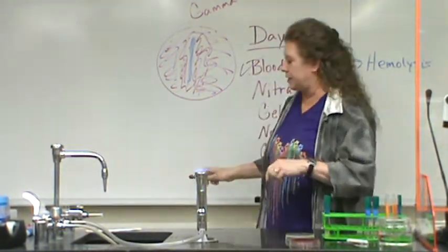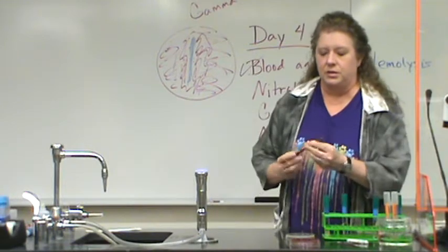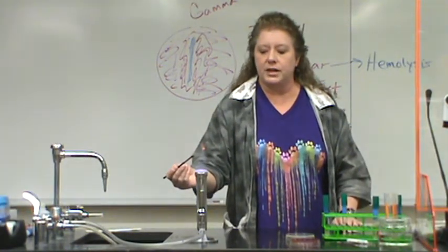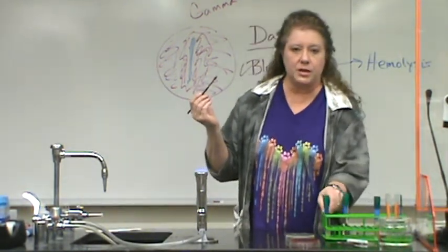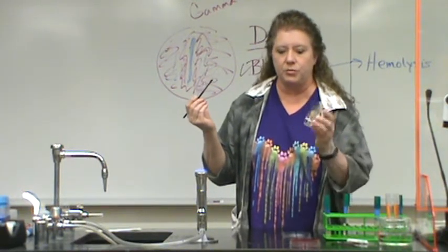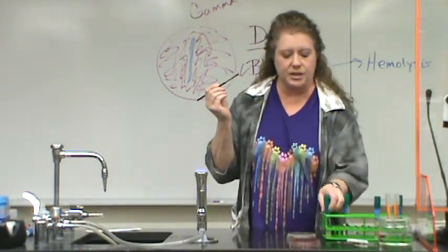The nitrate test, you're going to use a nitrate broth that you've labeled with isolate number 1. You're using your inoculating loop for this. It's a simple broth inoculation. Sterilize your loop. Let it cool. Pick up your TSA plate of isolate number 1. Cool your loop somewhere where there's no bacteria. Get a little bacteria. Put your plate down.